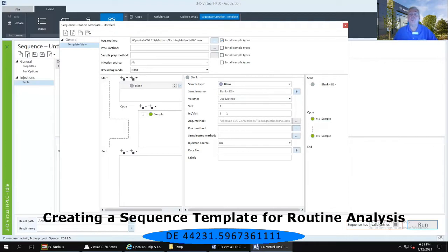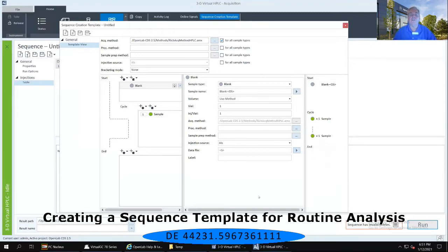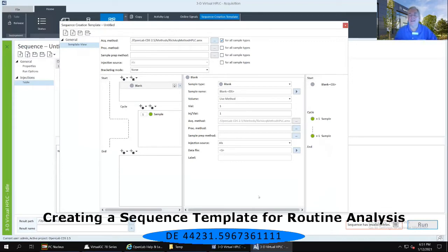My vial position is going to be vial position number one and one injection per vial. My acquisition method is automatically filled in. I don't fill in the processing or sample prep method, but I do want to fill in the data file — again using that right-facing arrow to the right of the data file text field, and I'm going to make that the same as my sample name. Any time I'm using software tokens, they get filled in with a triangular bracket — that's a visual cue that I am looking at a software token.